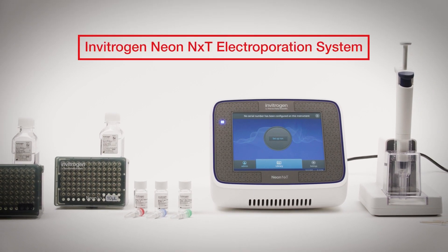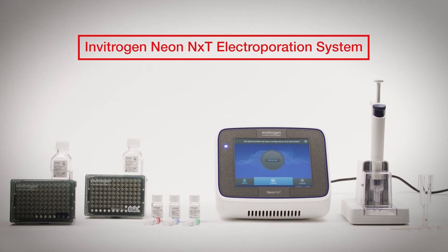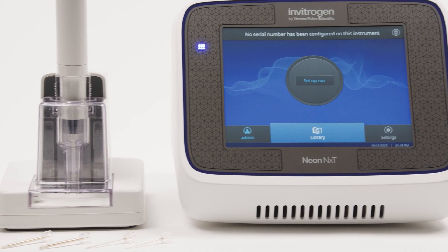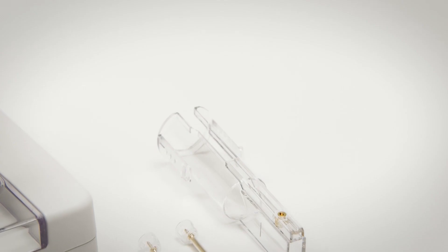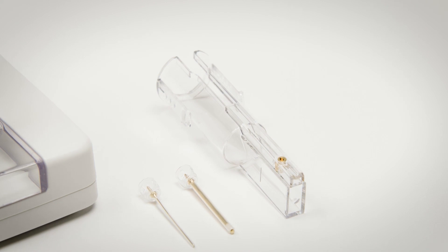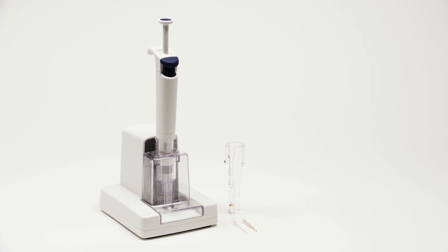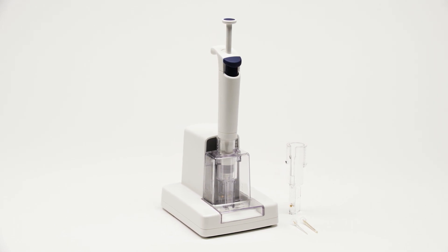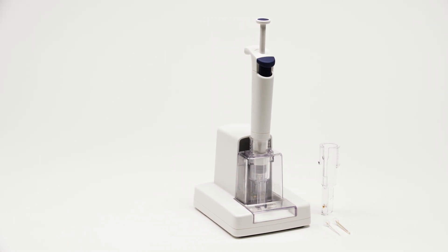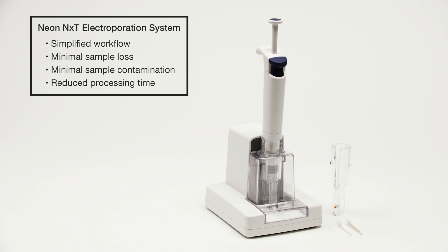Introducing the Invitrogen NeonNext Electroporation System, an innovative platform that streamlines the procedure for transfecting your cells. Unlike traditional electroporation instruments, the NeonNext Electroporation System uses the NeonNext Pipette Tip as the transfection vessel. The NeonNext Buffer Tube carries the other electrode near the bottom that transfers the electric field to the electrode inside the pipette tip. This unique technology greatly simplifies the workflow while minimizing sample loss and contamination and reducing processing time as compared to cuvette-based electroporation devices.